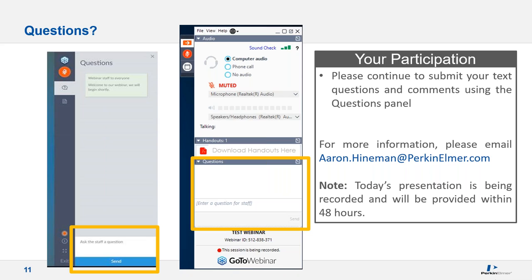In certain cases, depending on what the matrix is dissolved in, maybe you would have to do something special. But I've run some metallurgical samples that have been dissolved in up to 40% acid. And the only thing we did then was we increased the plasma flow to make the torch a little more stable and extend the torch lifetime a little bit. But generally, when running metallurgical, it's just going to be a high level of dissolved solids, so you don't need to do anything too special. And generally, it's going to be around 1% to 2% dissolved solids. Okay. Thanks, Ken. So standard sample intro, basically.